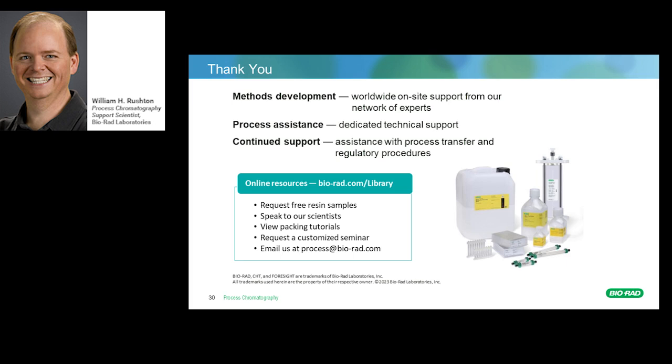One good thing about it is, like I said, it's irreversible, so you don't have to worry about it leaching back off into any of your product effluents. Also, because it is irreversible, it will not impact the performance of the column. It just shows this color, so it might not look great, but it's not harming the usage of the CHT at all.